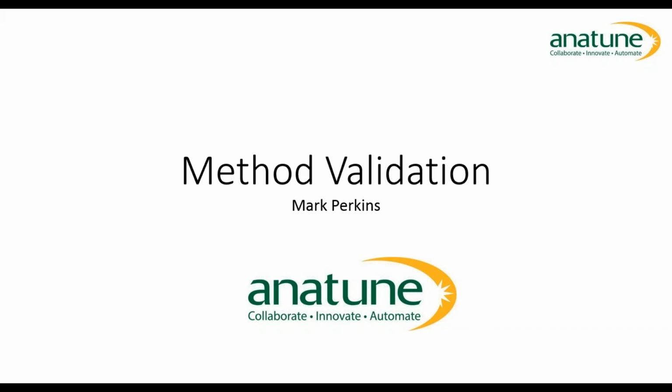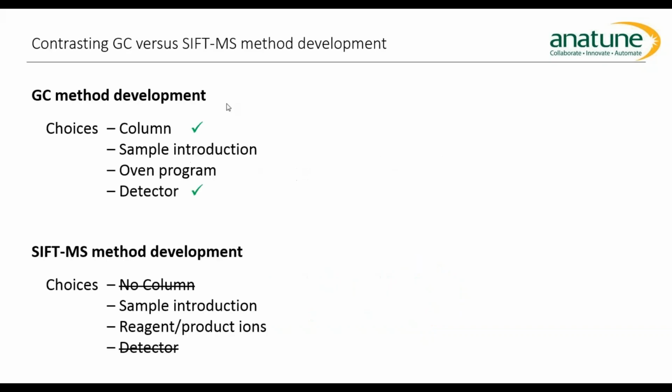And questions about how to validate SIFT-MS methods have been around for a while. Is it possible to do it? And what I hope to show you today in this webinar is it's entirely possible to validate SIFT-MS methods to make them robust, usable, analytical methodology. The first thing to discuss, I think, is going to be what's the difference between a SIFT-MS and a GC method in terms of the development, so that we can then understand how to validate the method.